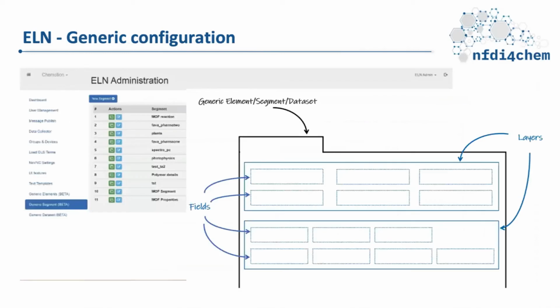As I mentioned before, initially Chemotion used to have a few generic elements, but now efforts have been put in place in order to make it more generic. So you can now find generic elements on Chemotion where it doesn't have to be related to chemistry alone, but if you are capturing information that is structured in the form of a document, then you can possibly reproduce the same structure within Chemotion and capture the information all along the way.